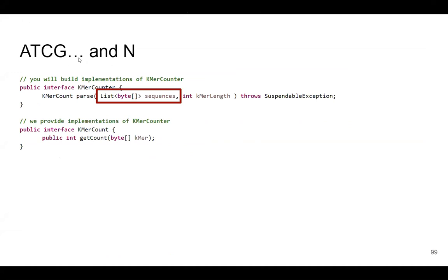If you were looking for, we talked about, again, in the video where I break down SARS-CoV-2, there's just sometimes when you're reading it, a lot of times at the beginning there's an error, at the end there's errors, and at the centromere sometimes in chromosomes, there'll be errors. Sometimes they'll just be errors, right? They don't know whether, well, this might be an A or a T, I'm not sure. And so I've split up the full chromosome data into a series of sequences that are the consistent part.